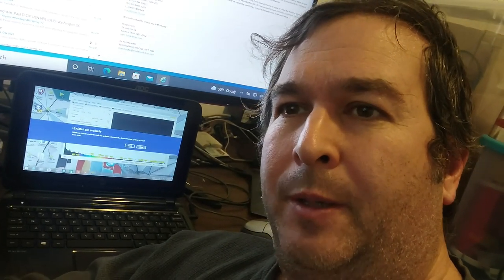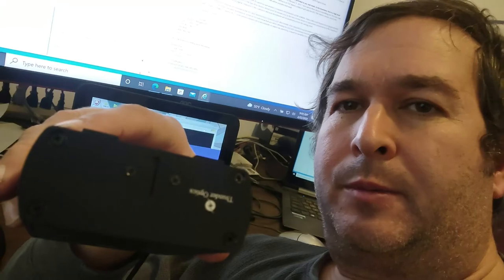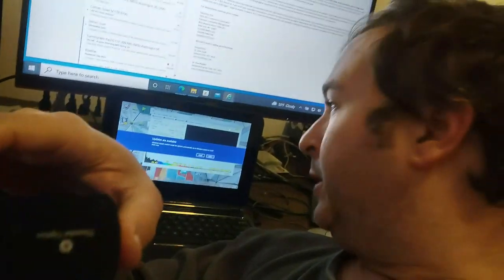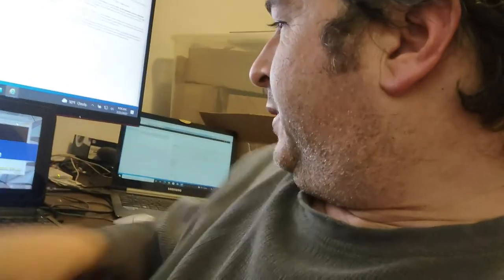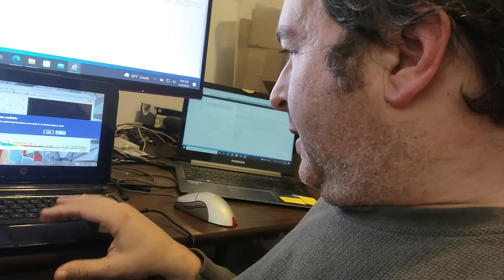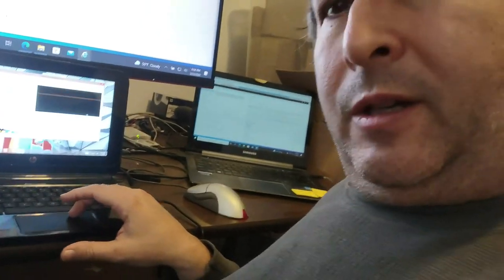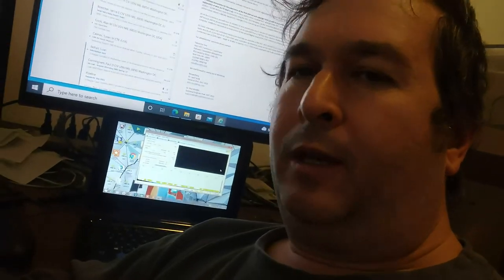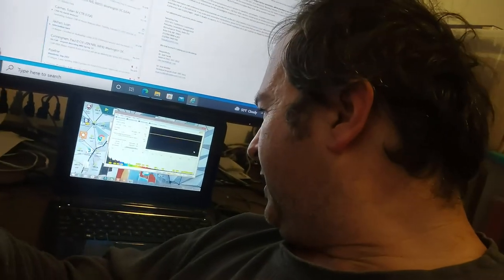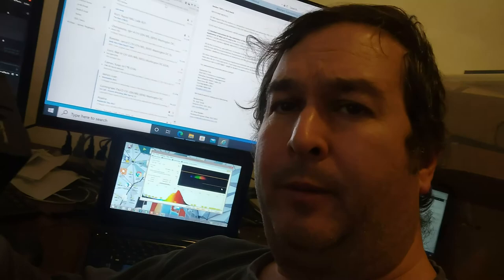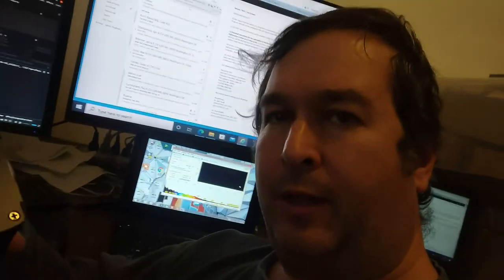Okay, hello, this is Dr. Jaynes, and today I'm going to talk about my Thunder Optics $99 spectrometer. I have the software running in the background. Very cool. Works through USB, goes from about 270 nanometers to about 1200 nanometers, so into the ultraviolet and the infrared.